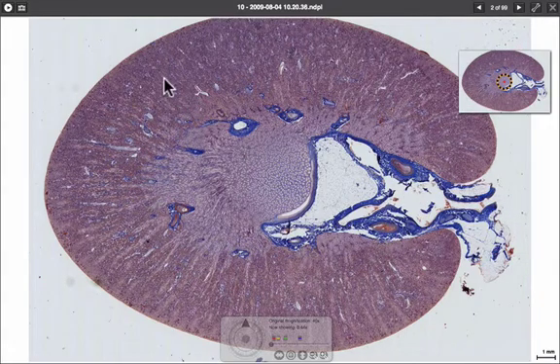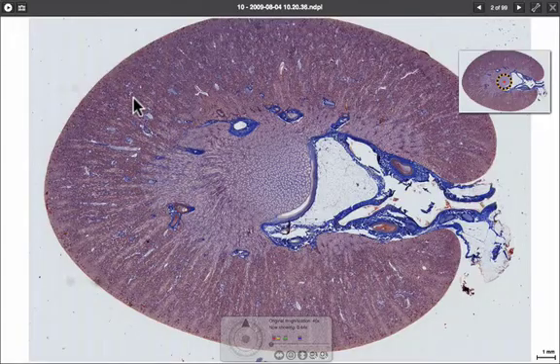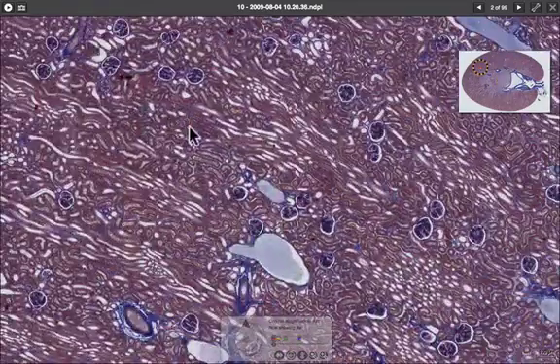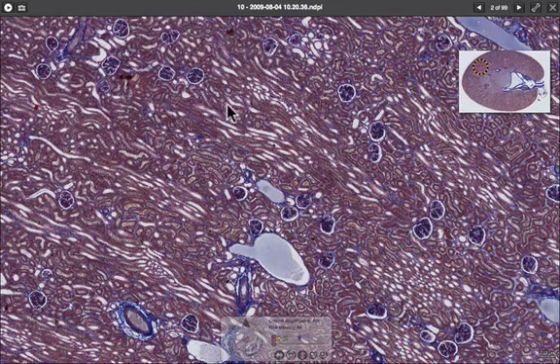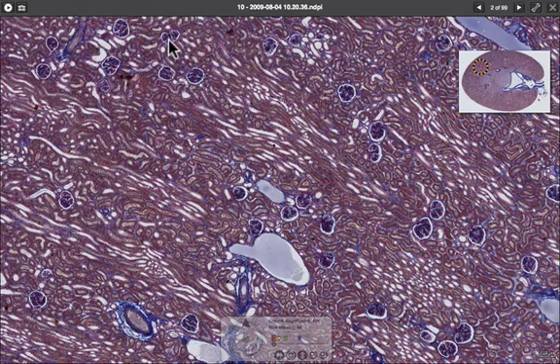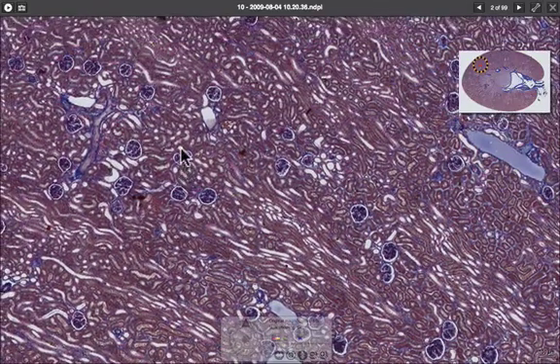At higher magnification in the cortex of the kidney we can see lots of tubes cut in cross section, longitudinal section, and oblique section. We can also see lots of these little round balls of cells — these are the glomeruli of the kidney. Let's zoom in on one.